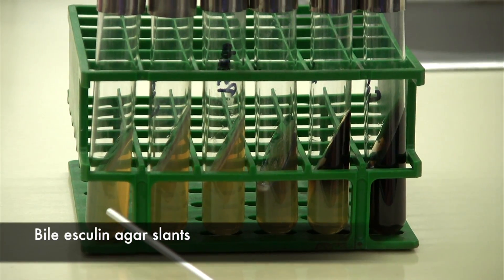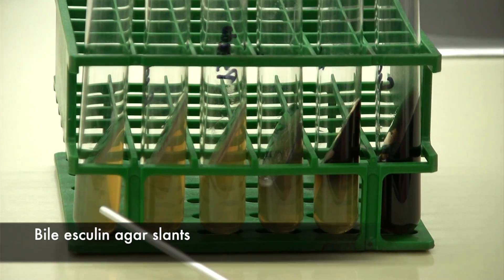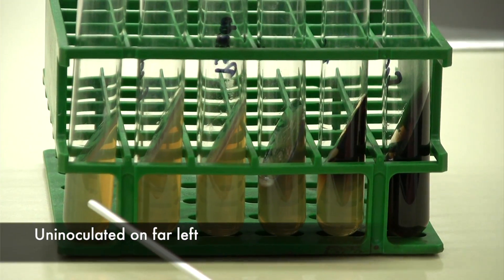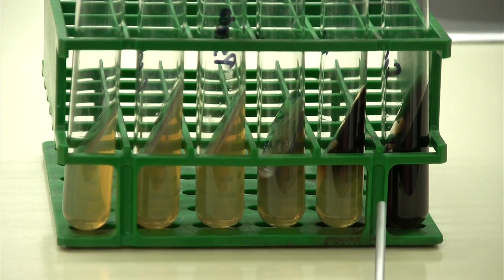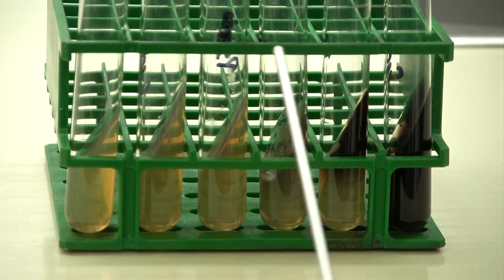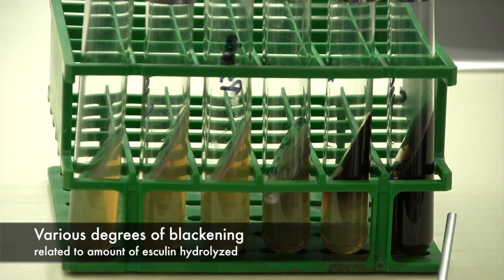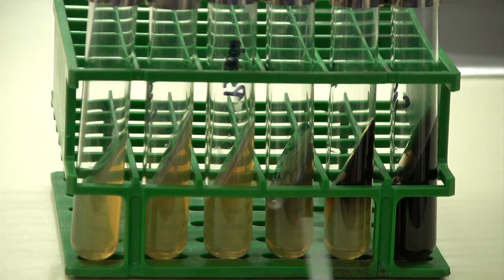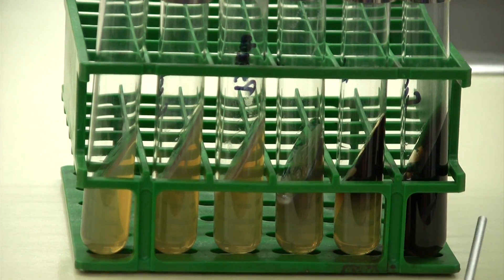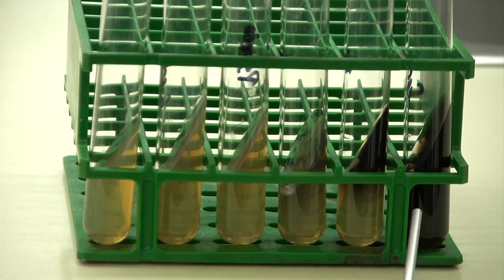Here we have a set of bile esculin agar slants, and the one on the left is uninoculated. All of these remaining tubes have been inoculated with various bacteria. You can see various degrees of blackening in these agars, which means that they have grown in the presence of bile and they have hydrolyzed the esculin, which causes the blackening.